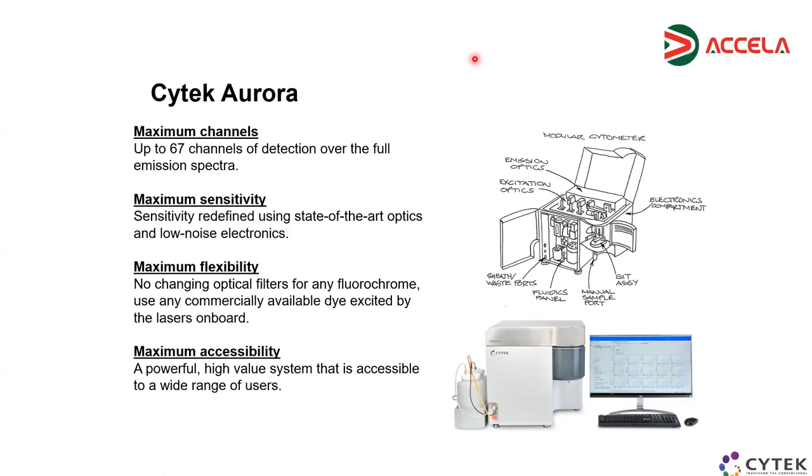For cleaning simply the flow cell to avoid the cross-contamination. And at the end of the day, there is a shutdown procedure which is composed of four steps, and the software will tell you exactly what to prepare. So one tube with water, one tube with ethanol, one tube with Contrad, with bleach, with water and with Contrad, to make sure that the day after your system is in perfect shape and clean to be used again.